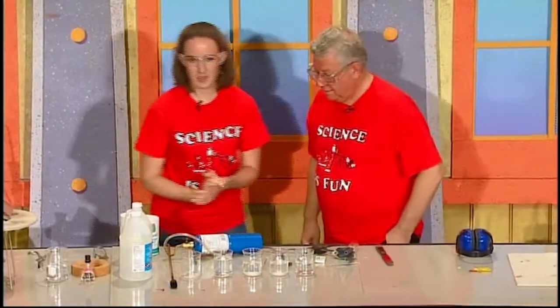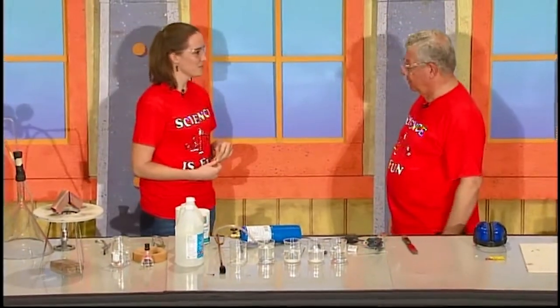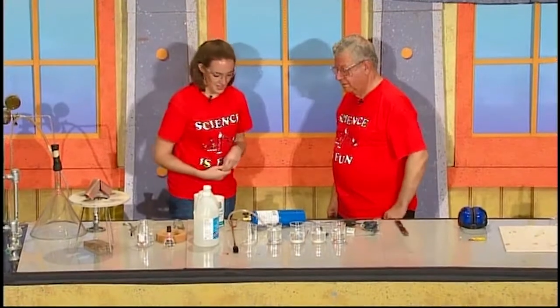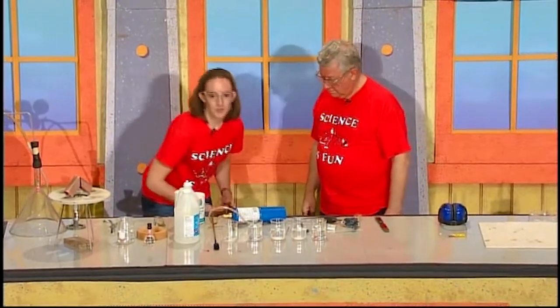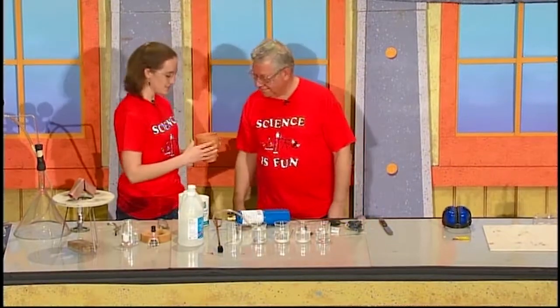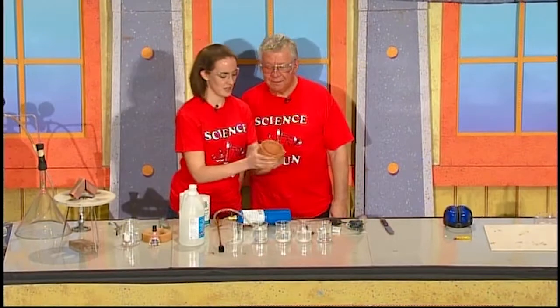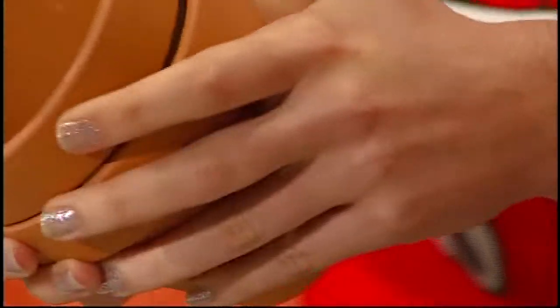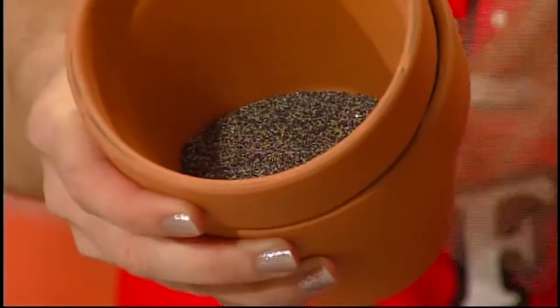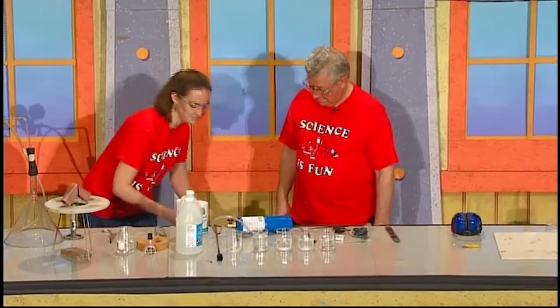But now I have one more experiment I'd like to show you guys. Maybe something a little bit flashier even. Flashier than this. All right, if you say so. So I'm going to show you a very exothermic reaction, something that's going to produce a lot of light and heat. So here I have your typical flower pots from like Home Depot. And you can see inside there's kind of the sand stuff. And so that's an iron oxide, like the rust that forms on metal objects at home, and also aluminum.